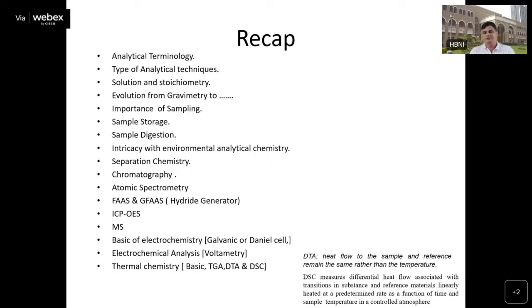Whereas there are certain elements like arsenic and selenium, which give their best detection limit as hydrides. So in this case, we use quartz cells where we convert the arsenic and selenium into hydrides by using sodium borohydride and HCl mixtures. And then we do the analysis, where in all these cases the most important thing is that we have to bring the molecule into the atomic form.